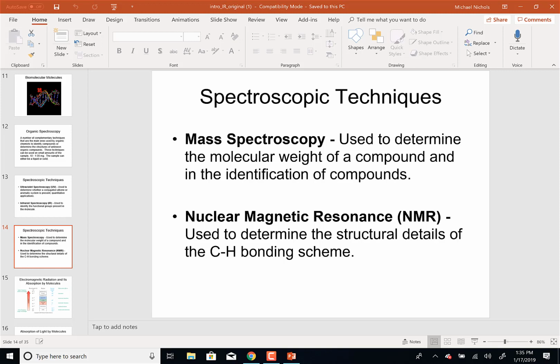And then finally, NMR, which is the one we're going to spend the most time on because that gives us the carbon-hydrogen skeleton of the molecule. So we can determine the difference between methyl, ethyl, isopropyl, propyl, isobutyl, butyl, tert-butyl. We can tell the differences in all those groups using NMR. And so in my opinion, that's the most powerful one, but that's because I've been doing NMR for a long time. And if I was a mass spectrometry person, I would tell you that mass spectrometry is the way to go. But those two are very, very powerful.